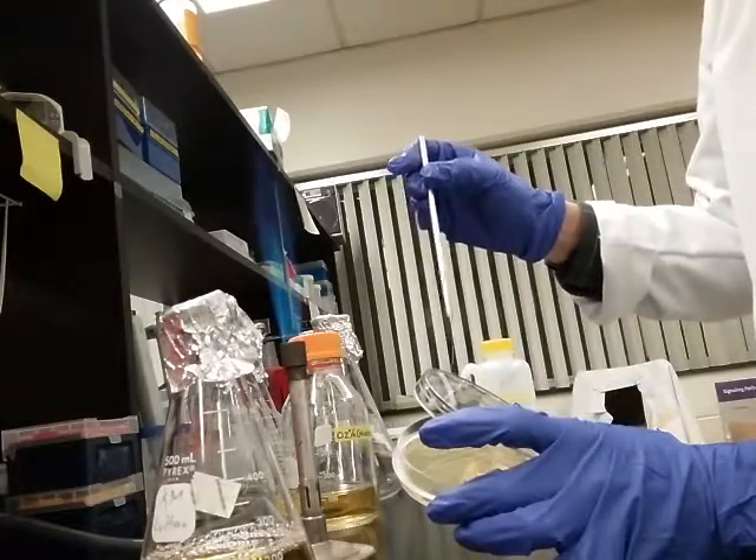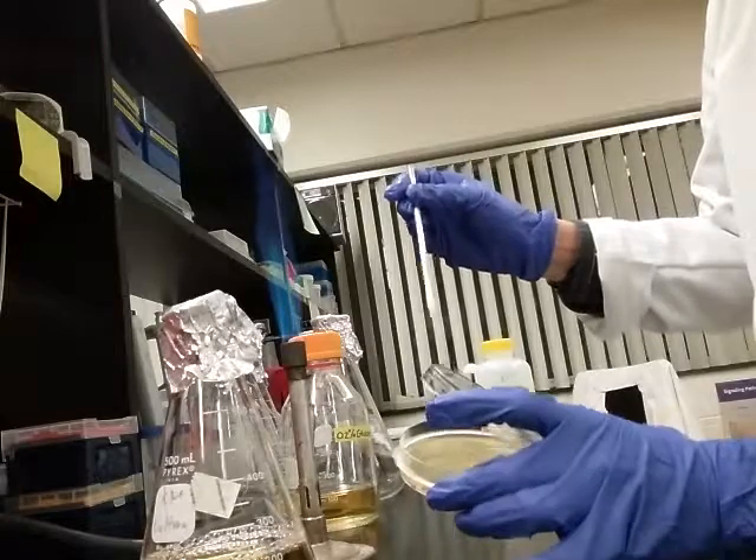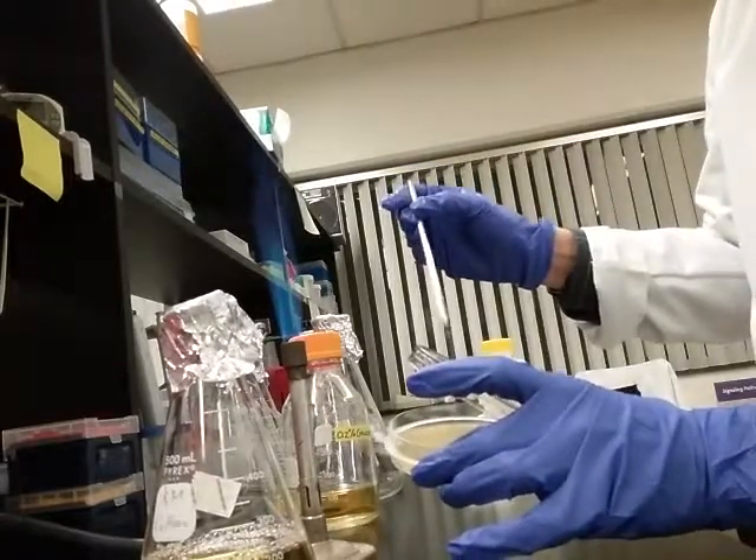Now I'm just going to get lots of the bacteria that I can and inoculate my flask.